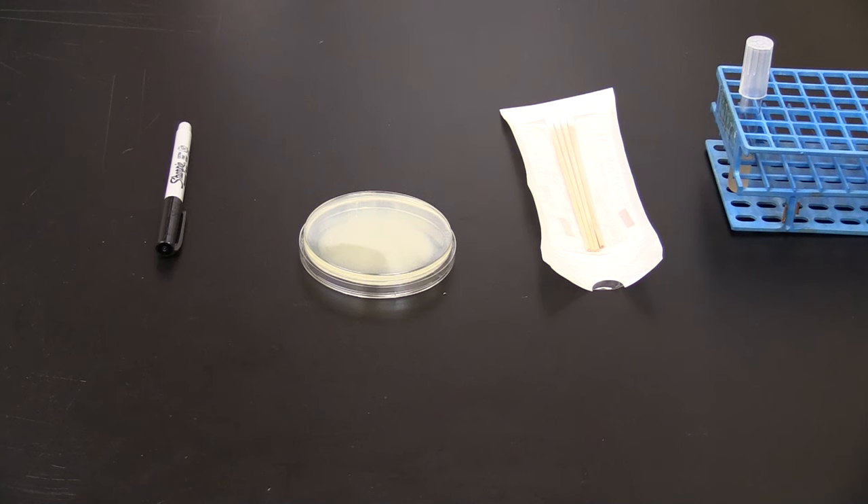The Kirby-Bauer assay is a widely used and effective way to test if a bacterium is resistant or sensitive to several antimicrobial compounds simultaneously.